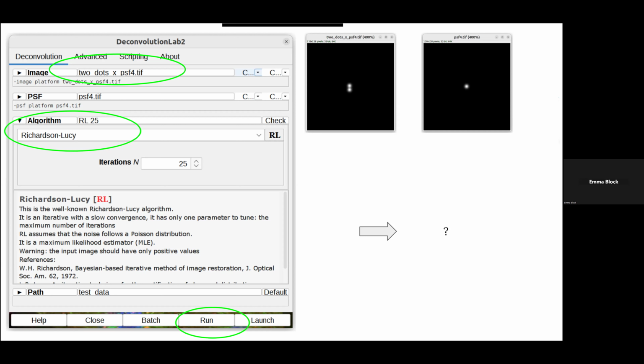It doesn't look exactly the same, the 2 dots. Yeah, I have the same. It doesn't look so sharp. Right. That is the expected result. So that's all right. Does anyone want us to wait a little more before continuing, or did you get there?